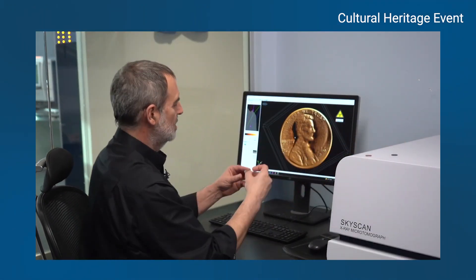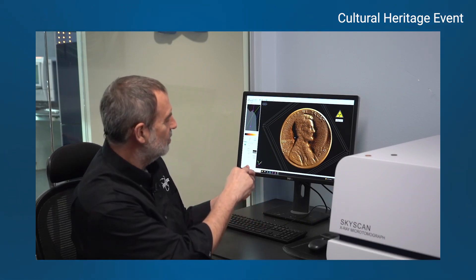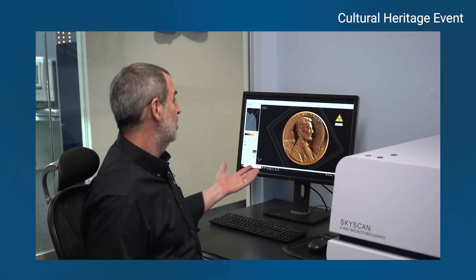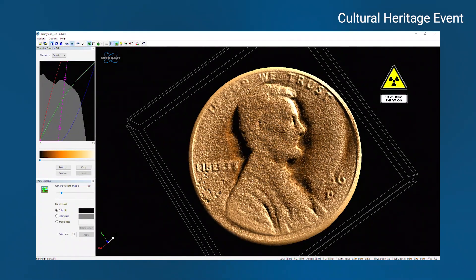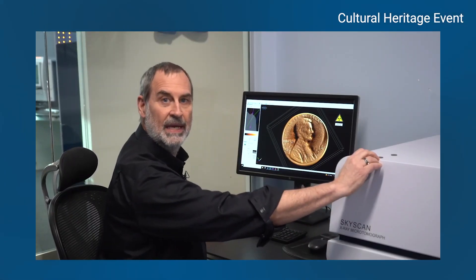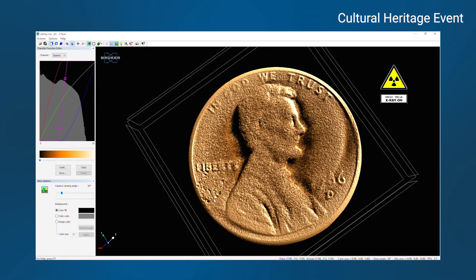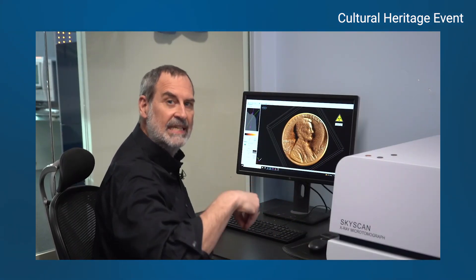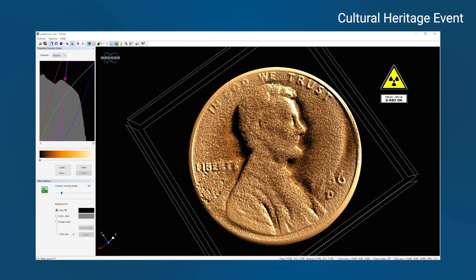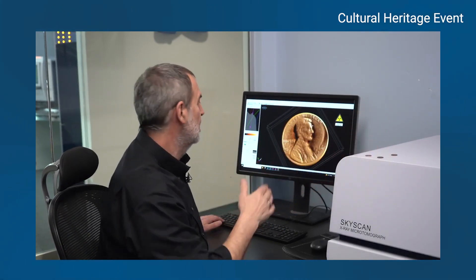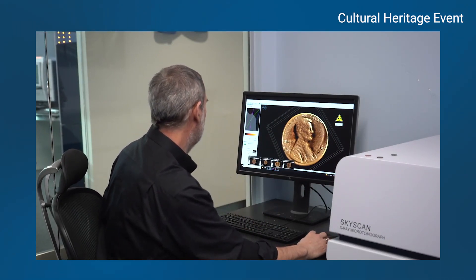Sample number two is a penny with some corrosion. There's corrosion on the side hiding some of the lettering, and some coloration in a couple of places. What immediately jumps out is that I can actually read the word 'Liberty' here, which I can't read on the physical penny — so underneath the greenish corrosion is the word Liberty. I can also see pitting, which is damage where the corrosion is eating down into the penny. There's also damage on Lincoln's head and forehead, which matches exactly what I see on the physical penny.